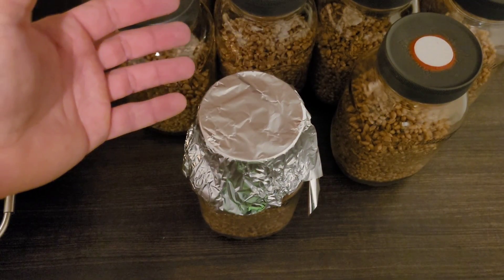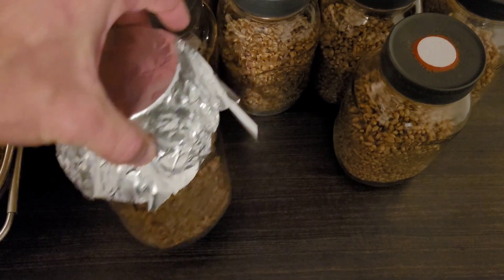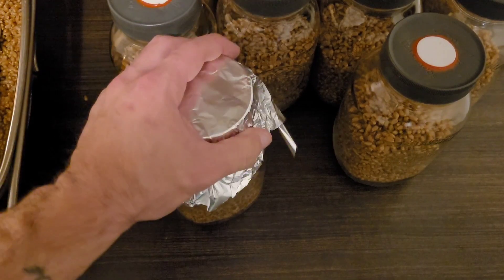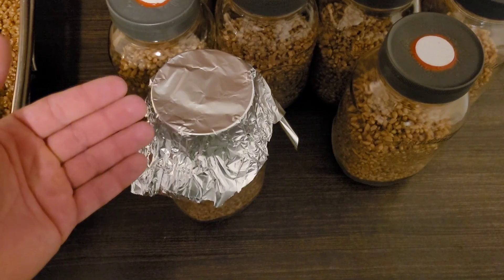Your gloved hands — whether or not they've been soaked with isopropyl or not — then grab the sterile jar by this barrier and bring it over to your workstation, where you would then take it off and do your work, maintaining the sterility of the opening of your sterile vessel. It's not necessary, but it's nice to have.